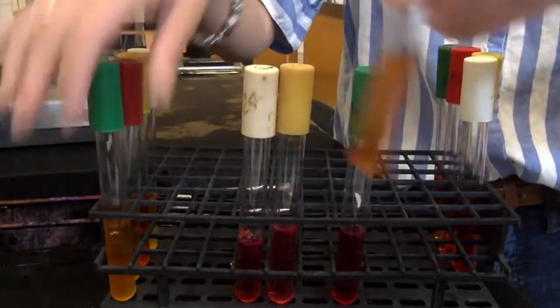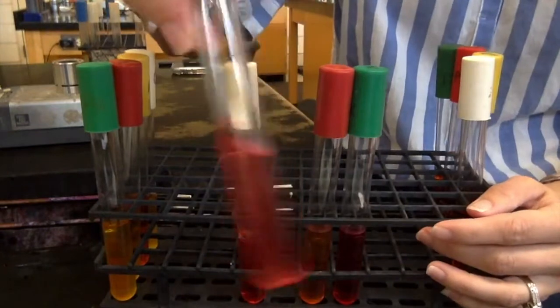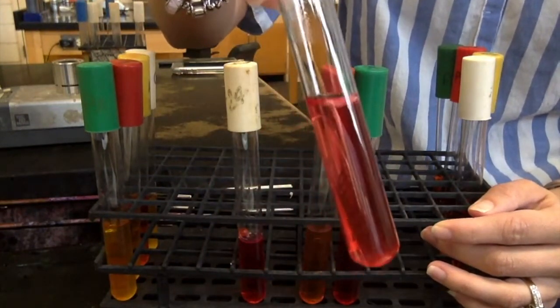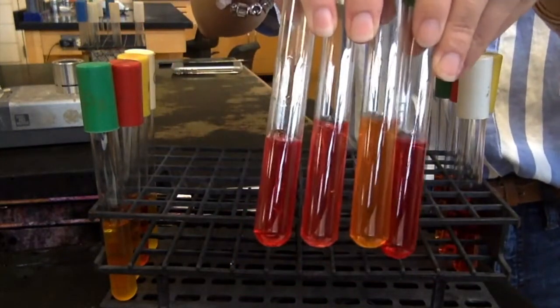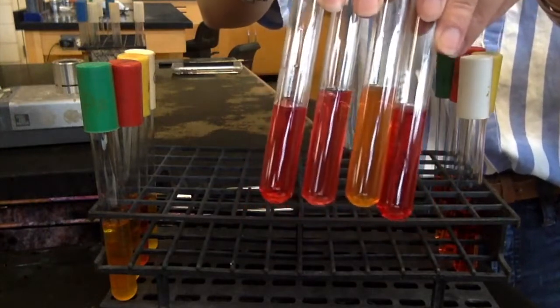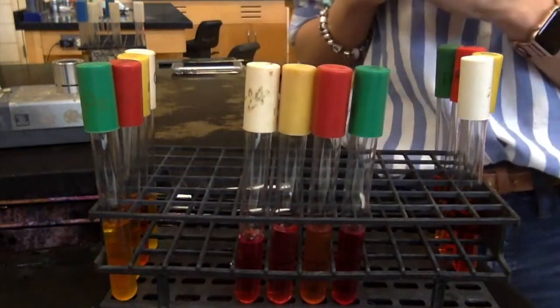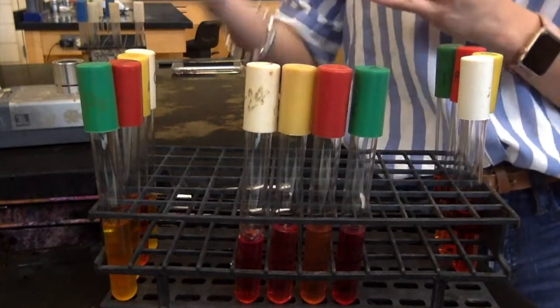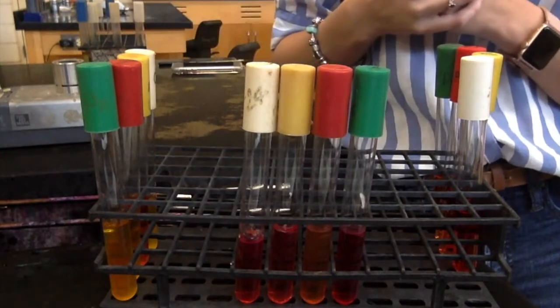Okay. So my Pseudomonas, now you can still tell that there's growth there. There's cloudiness in the tube. So the Pseudomonas grew, but it is a non-fermenter. So it does not use the sugar for fermentation. It uses it for respiration because Pseudomonas is a strict aerobe. If you remember from our motility test, Pseudomonas is a strict aerobe. What that means is it doesn't have the ability to ferment. It's only going to be able to do respiration.